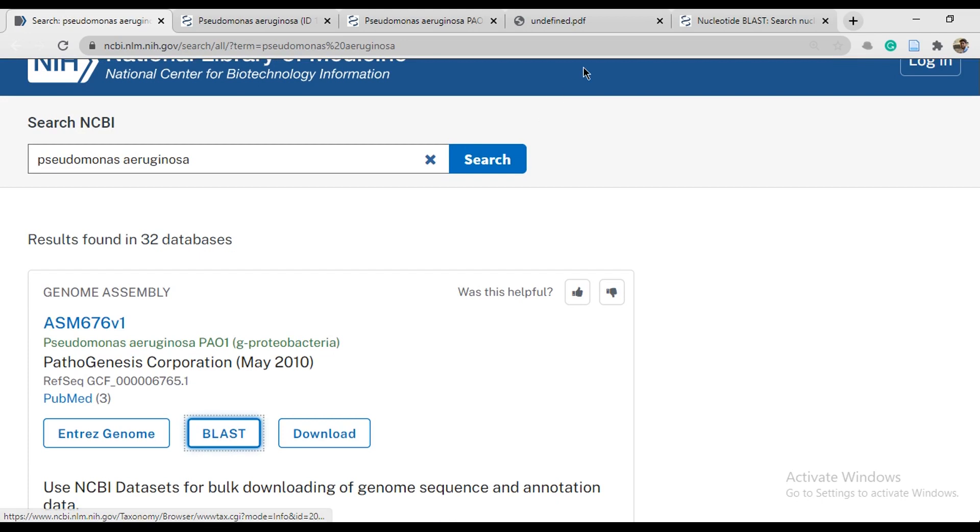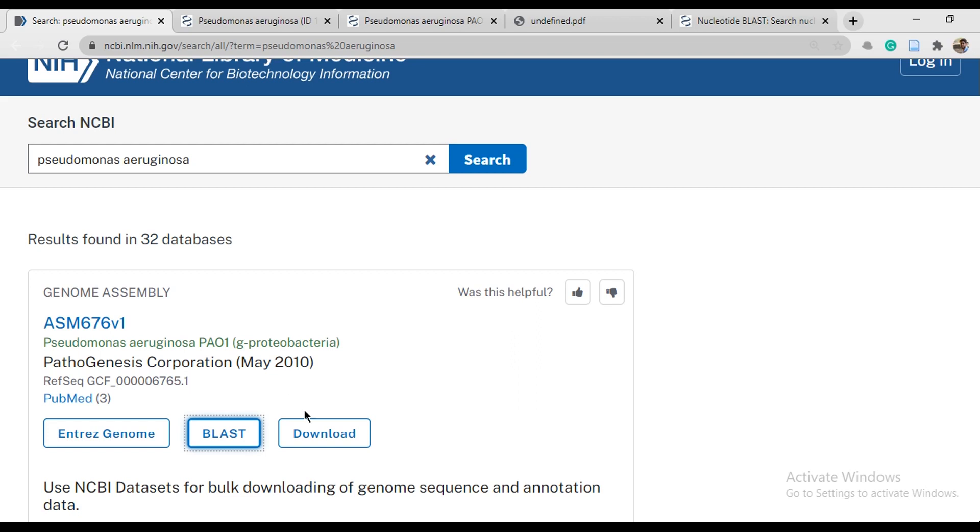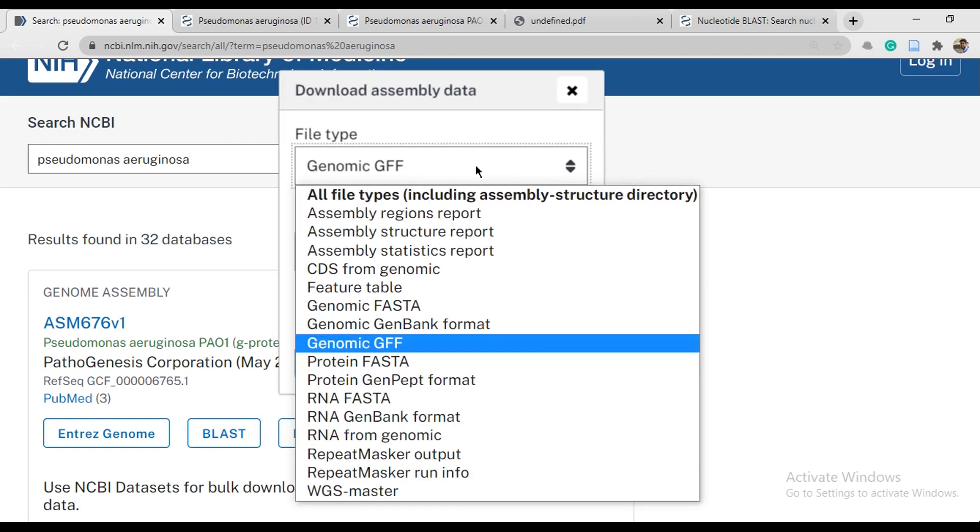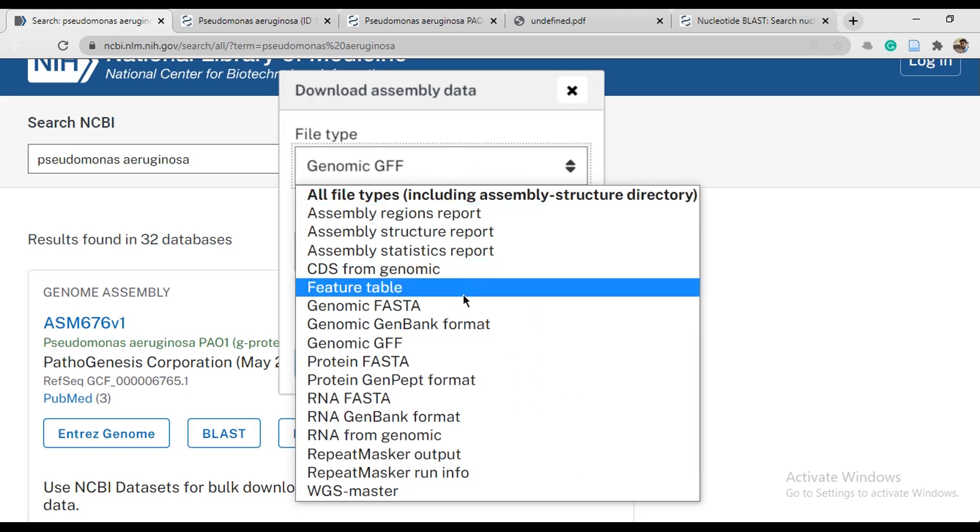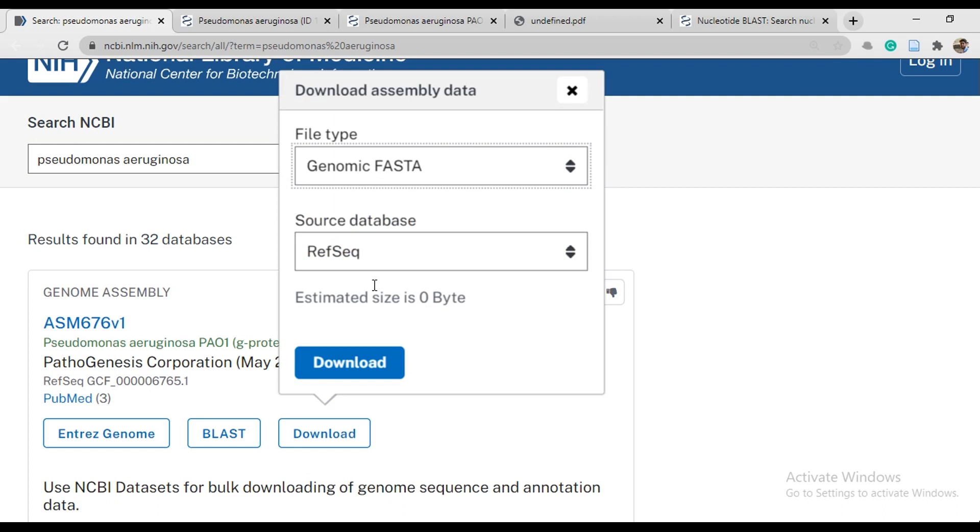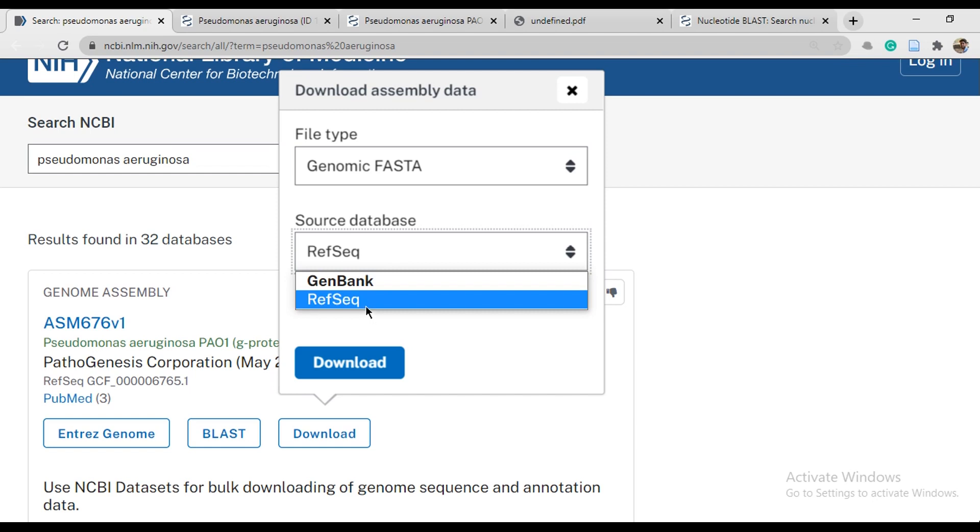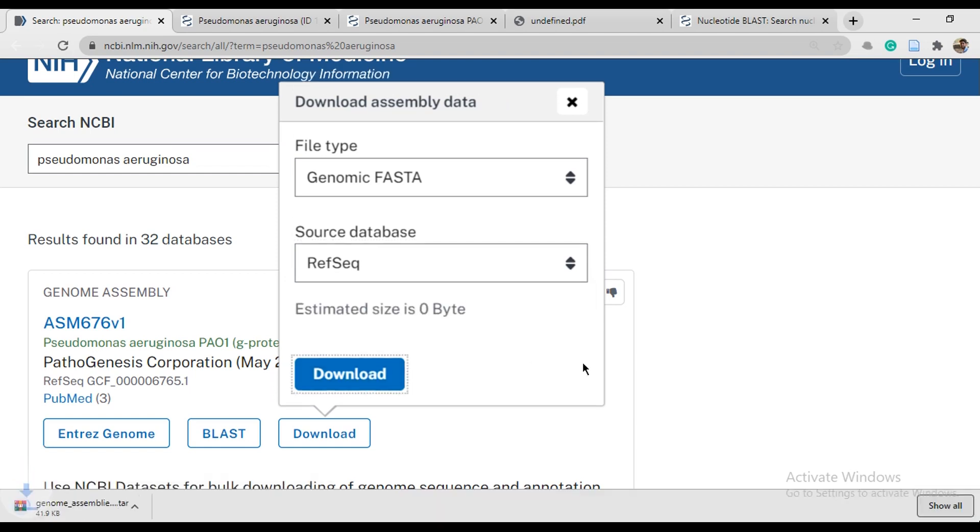First of all, we have FASTA sequence here. We discussed BLAST. Next time we will see the entire genome. We have direct download genome as FASTA source database from GenBank or website. You have downloaded the sequence and it will come to this file.